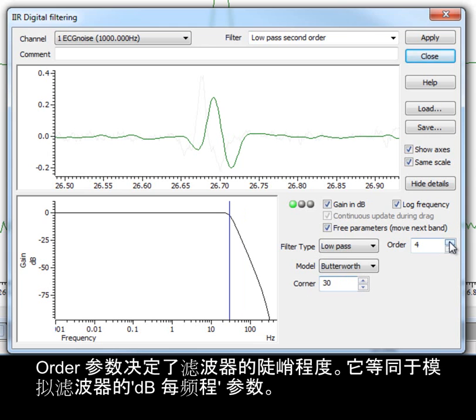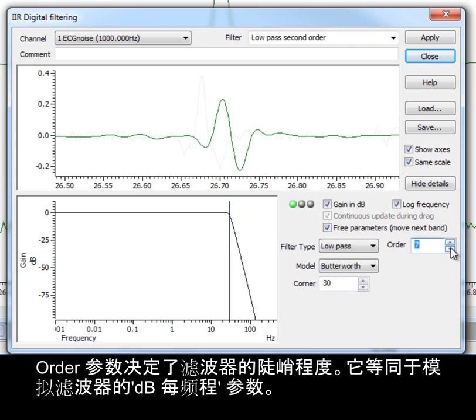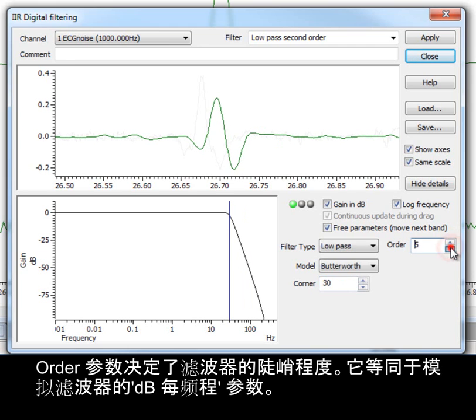The order setting determines the sharpness of the filter. This is equivalent to the dB per octave setting seen with analog filters.